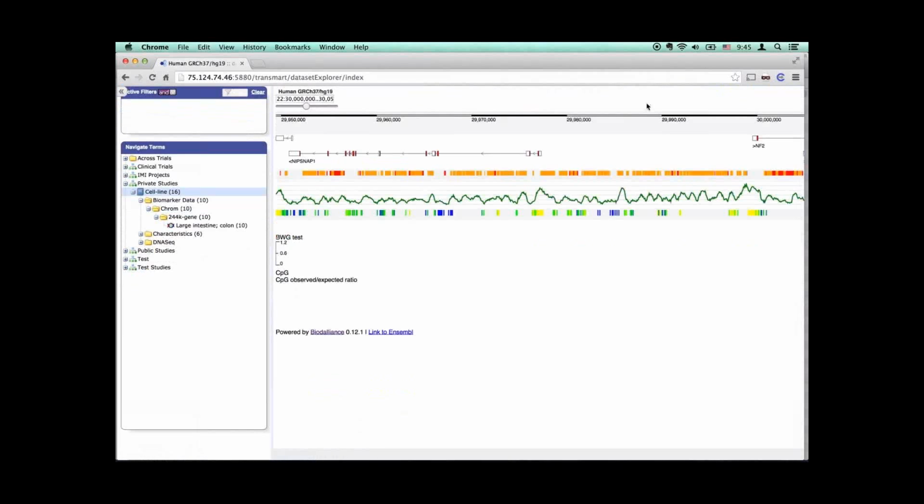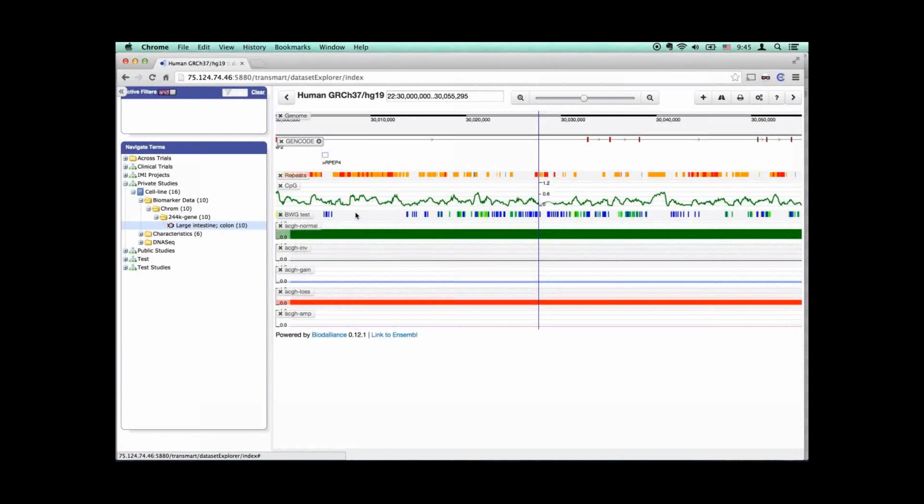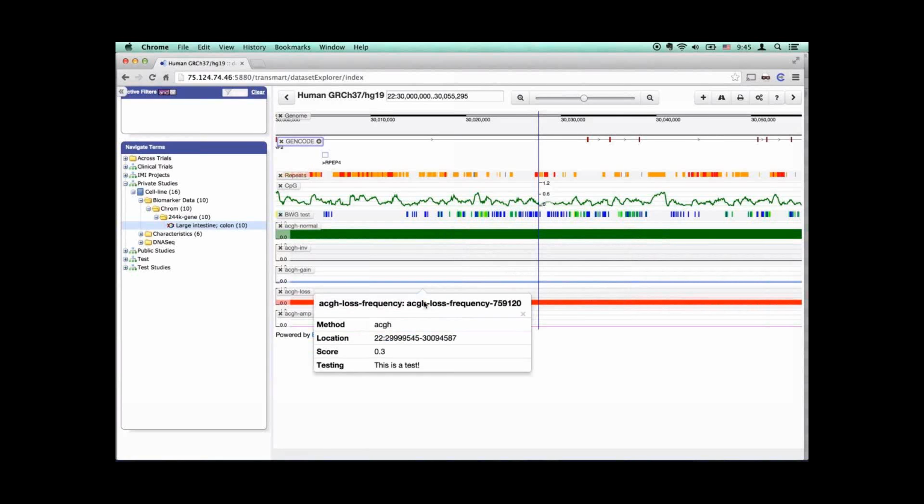So what I can do now is fire up the genome browser and then drag this particular high-dimensional data node into the browser, and that will bring up the tracks that are associated with that data. In this case, the gains and losses. Unfortunately, I'm too much zoomed in right now to see any differences. The genomic region is not long enough. If I would zoom out here, you would see the differences of the copy number in the regions.